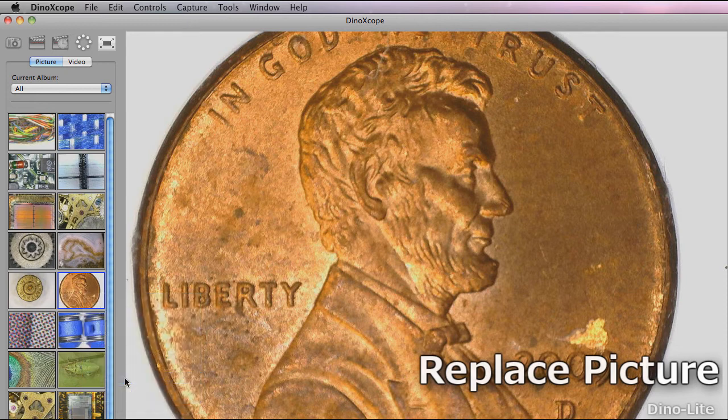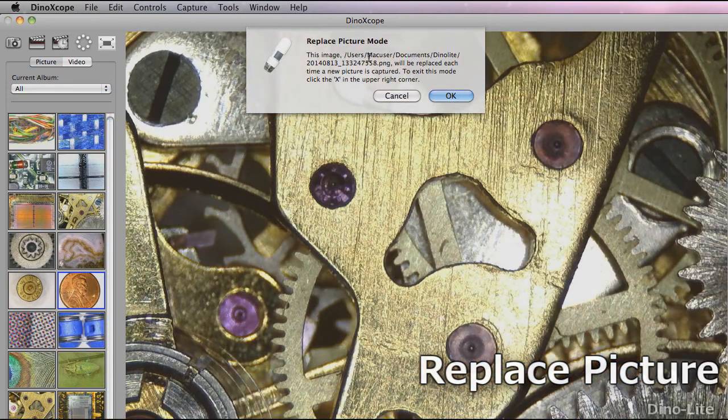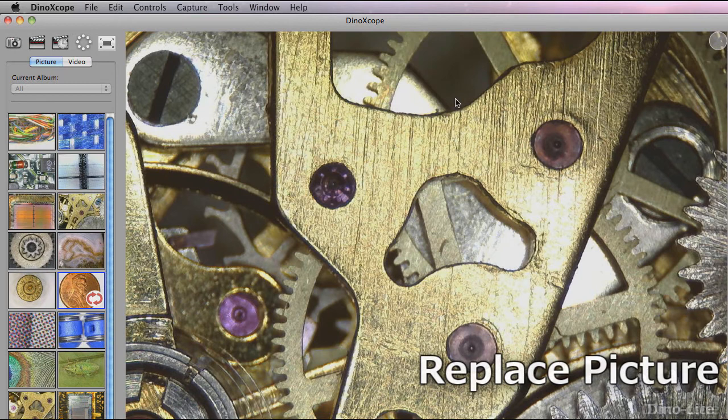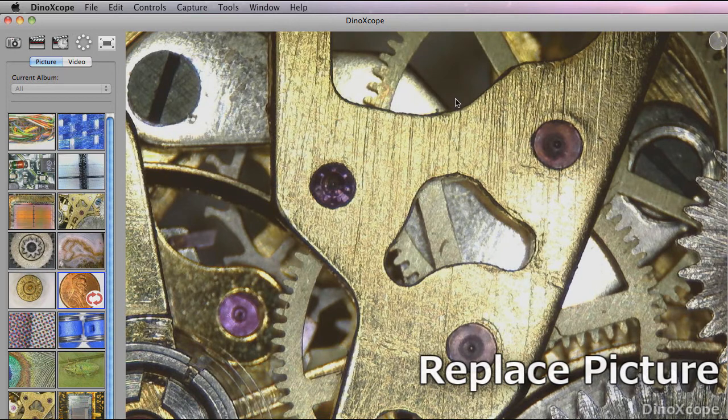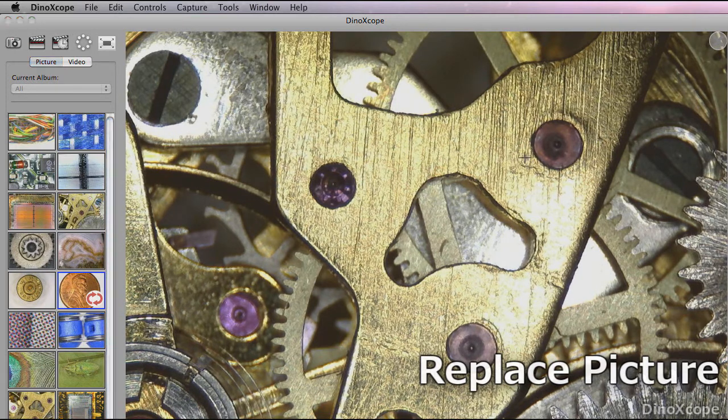Replace picture mode allows you to replace a current image in the thumbnail gallery with a new capture. Right click on an image and select replace picture mode then the next captured image will replace the previous image.